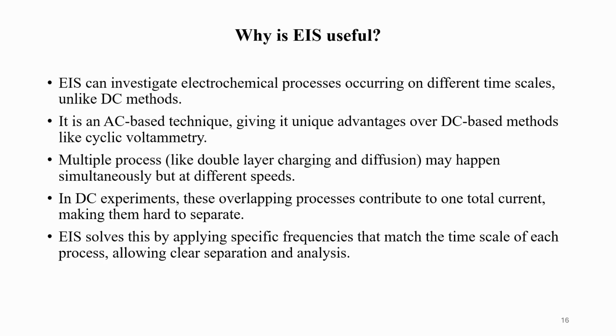EIS solves this problem by applying a signal at different frequencies. Each frequency corresponds to a specific time scale, so we can separate the individual processes clearly and understand them in more detail.